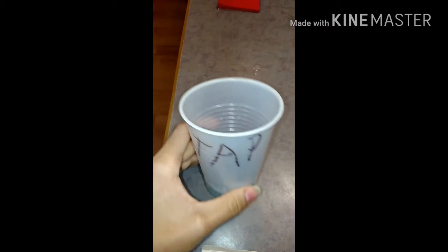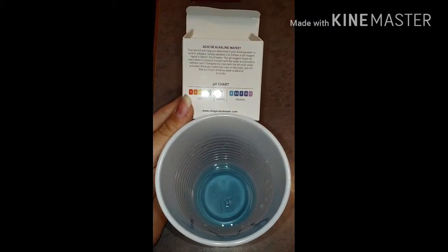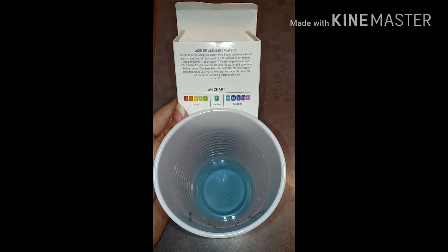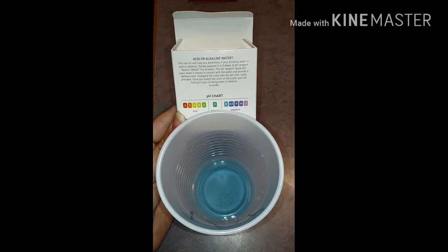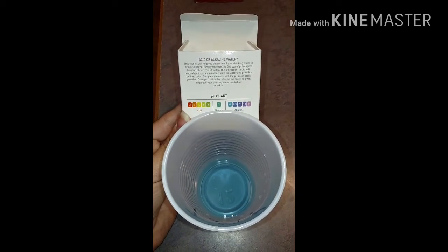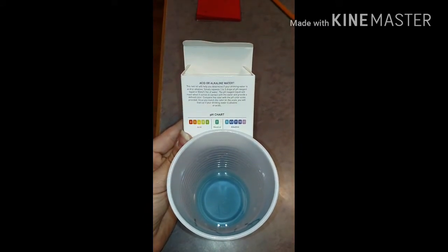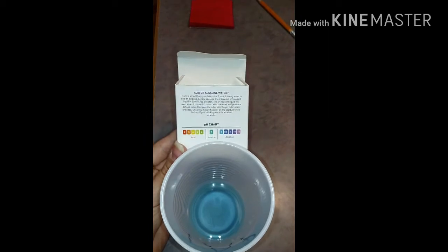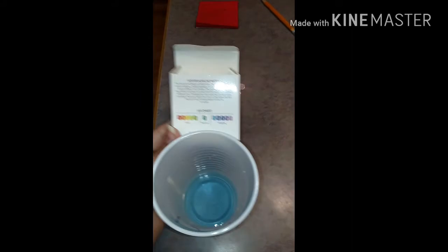We went ahead and swished them around and we got our colors. So the tap water here in Magoffin County in Eastern Kentucky — the color matches up really nicely with eight on the chart, so it's just barely alkaline, which is good. They're doing a good job with that. My personal preference is still not to drink it because of the chlorine and all the added chemicals, but as far as pH balance goes, it is not acidic — it is just barely alkaline.